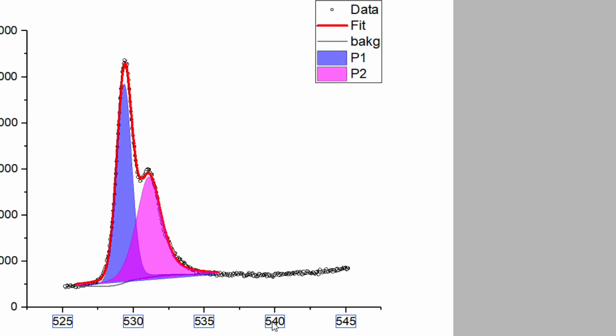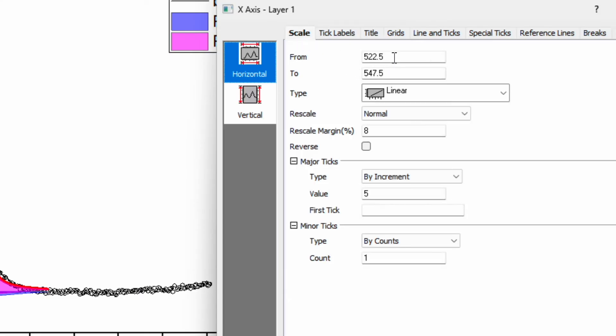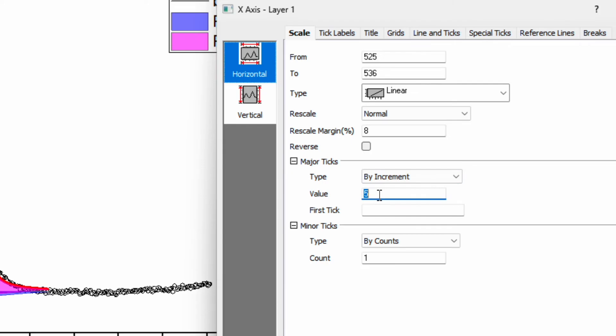Now click on the scale. Go to the scale and I want to change the scale from 525 to 536, with the major ticks by increment say 3, and then apply.